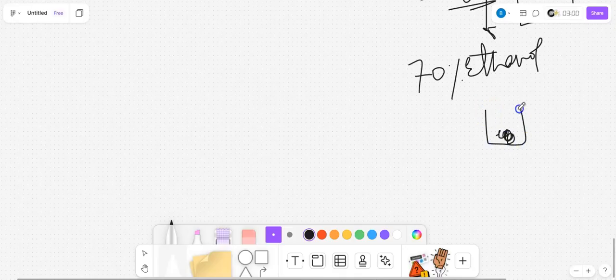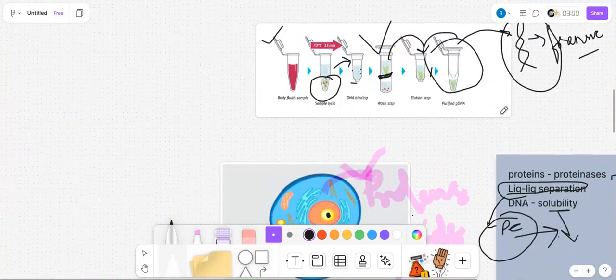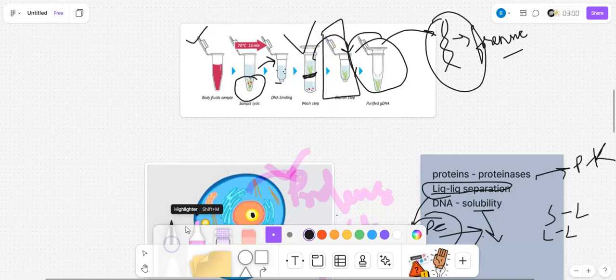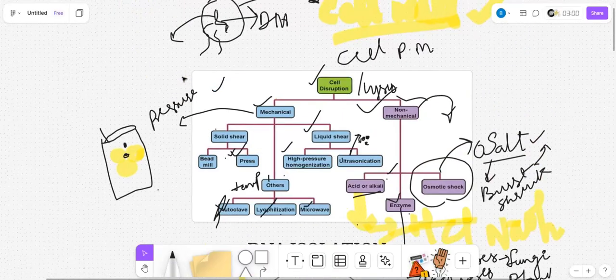So considered చేసిన DNA ని will be stored in a vial, like ఇక్కడ చూసారు కదా, a vial like this will be used to store the DNA. That is how this is done. That is how it is done. So this is the basic steps.